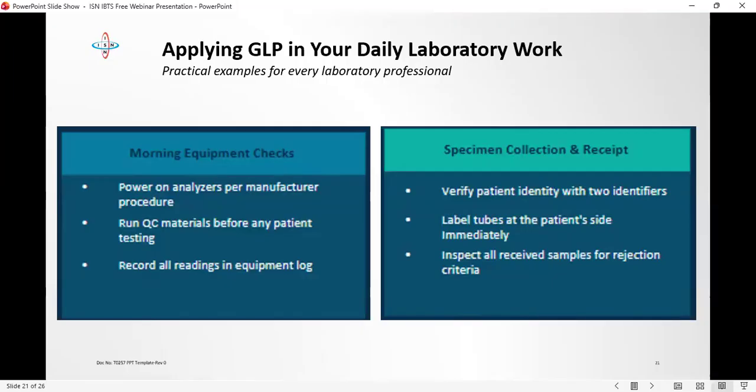You apply this good laboratory practice in daily work. It is not by just saying it. In the morning, you check your instruments. Do I have all the resources to work on it? Have they been maintained? Are they calibrated properly? These people collecting my specimen, are they identifying those patients with unique identifiers? Do you label your tubes? Do you barcode them? Who inspects all your samples? Those are the small things that can be put in place to ensure that we are doing the right thing in the laboratory.